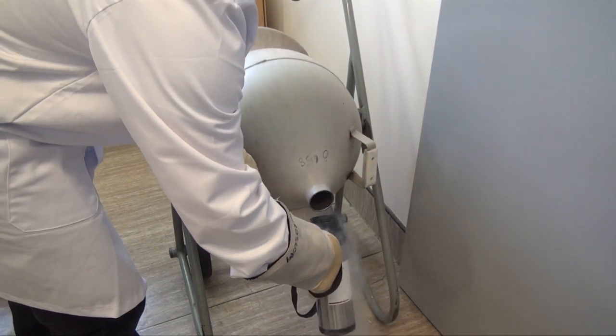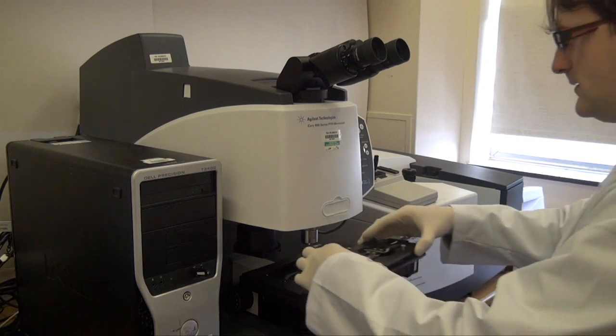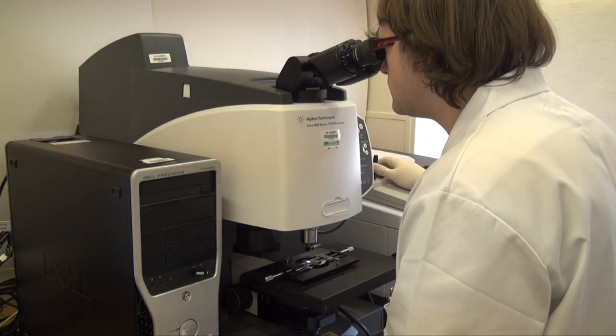A focal plane array detector, cooled by liquid nitrogen, enables us to analyze the different layers simultaneously and create a chemical map of the cross section. The sample is first focused under the beam, where the different layers can be seen.